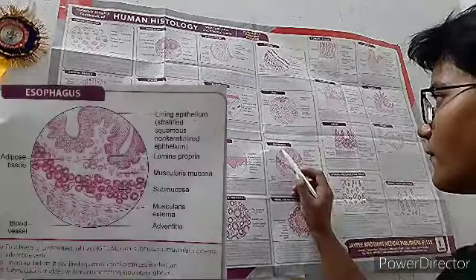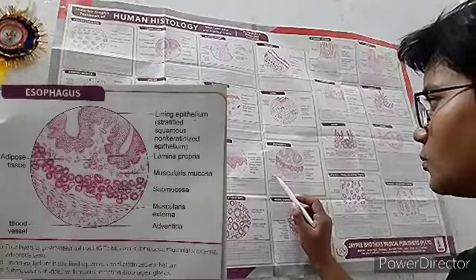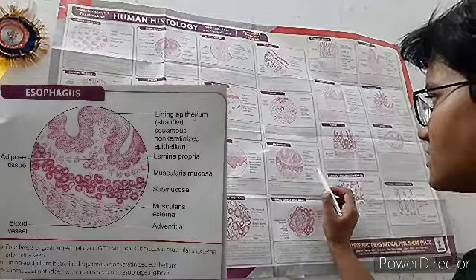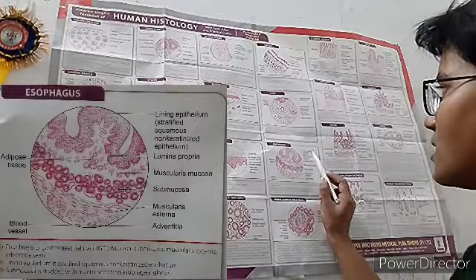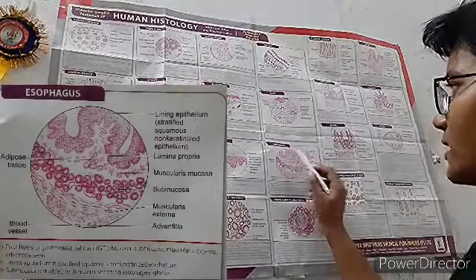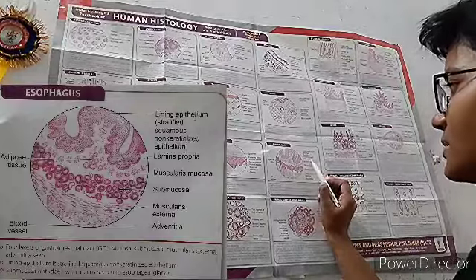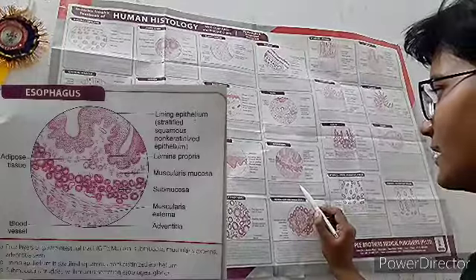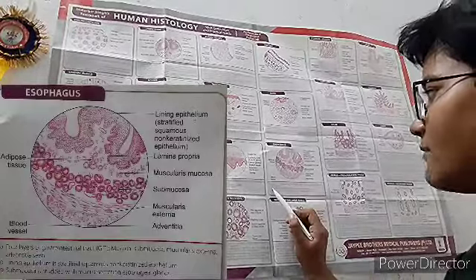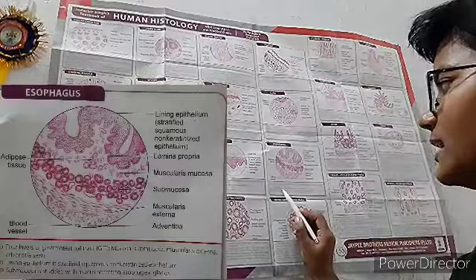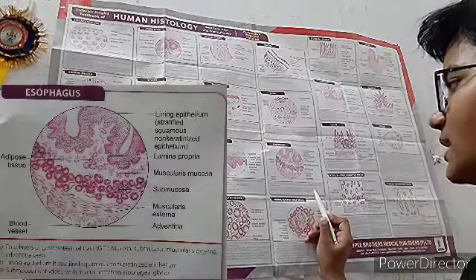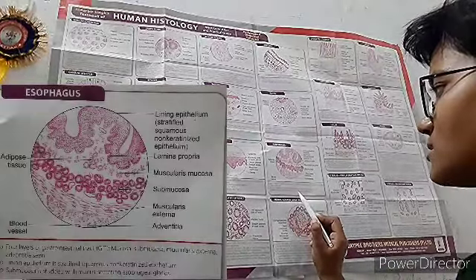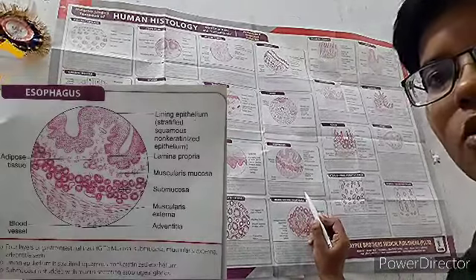Now the esophagus. Visible structures include adipose tissue, blood vessels, adventitia, muscularis externa, submucosa, muscularis mucosae, and lamina propria. The lining epithelium of the esophagus is stratified squamous non-keratinized epithelium. The full four layers of the gastrointestinal tract are present: mucosa, submucosa, muscularis externa, and adventitia. The submucosa is studded with mucous-secreting esophageal glands.